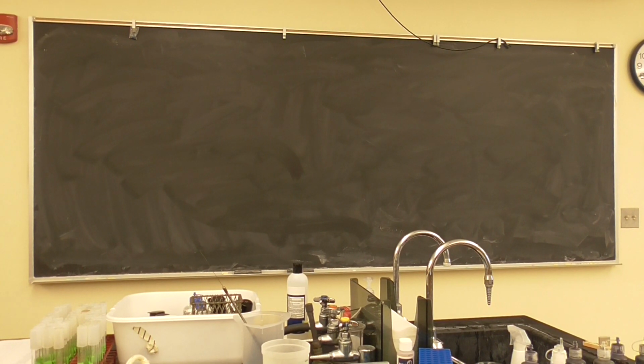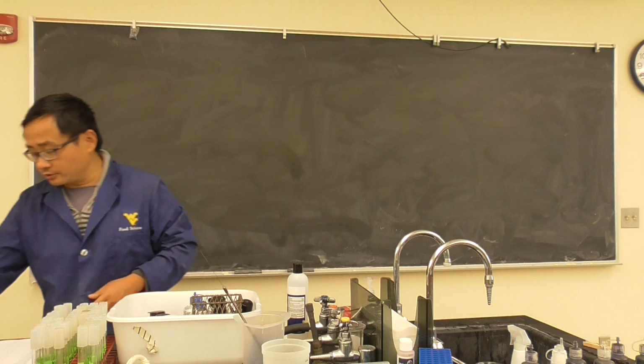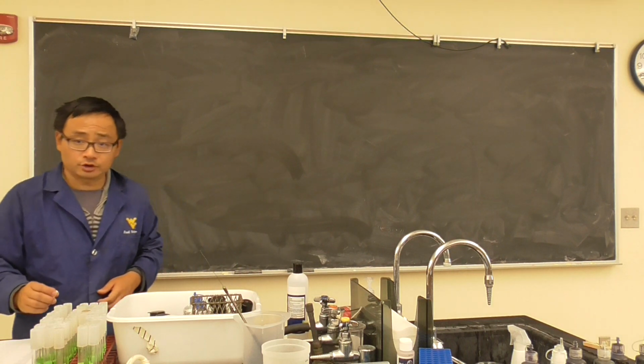Okay, so let's have a class. Some of you are still looking for that, it's okay. We are going to move to biochemical reaction number 3 today.